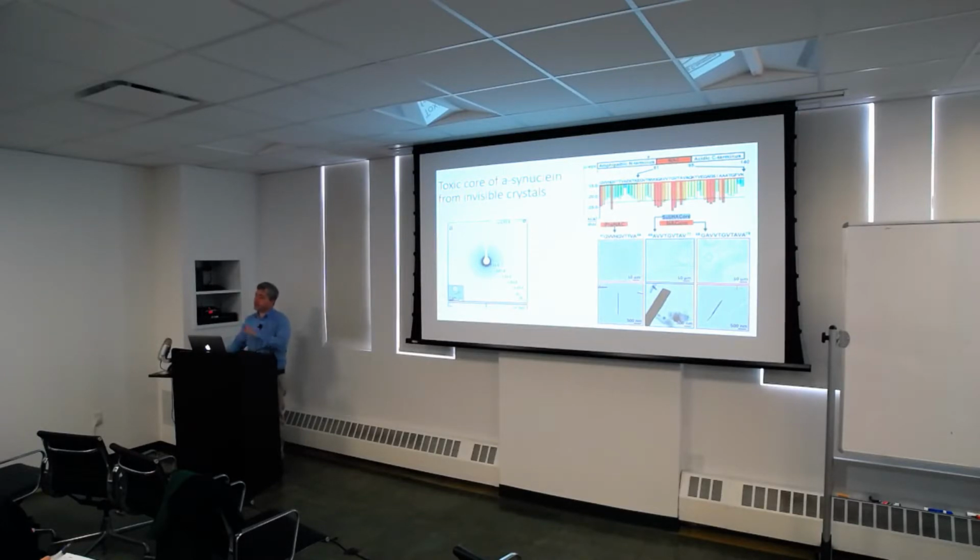Well, it can be microns long, on the order of a couple microns long, or 4 or 5 microns long, but it has to be thin in the direction that the beam is going through. Of course, if it's long and very flat, that would also be a problem, because then as you tilt it, it's going to appear to get thicker. But in practical terms, they found that about 400 nanometers for lysozyme crystals was the limit.